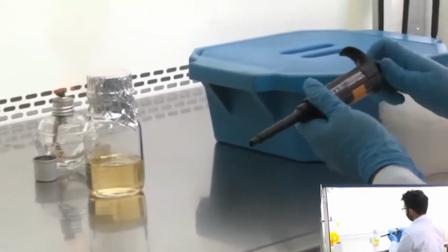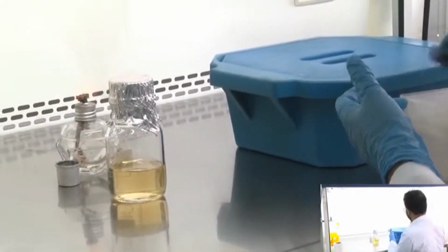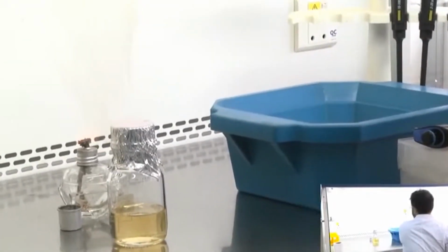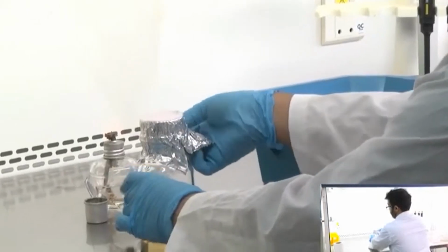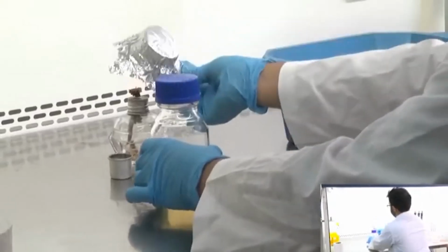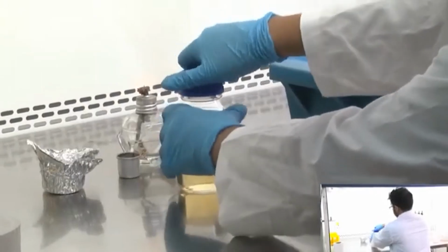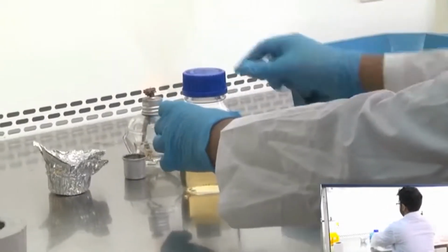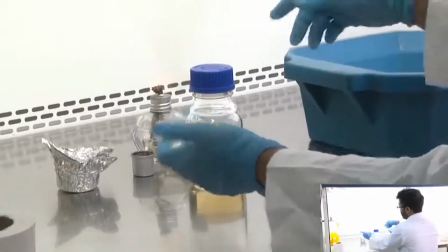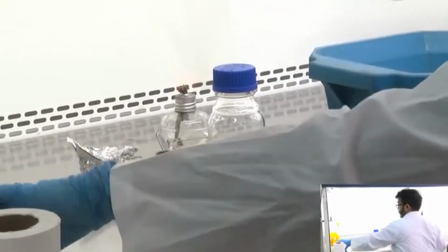Next, I am going to add 450 microliters of LB to those bacterial cells. This is autoclaved LB, so it is sterile. Make sure that your LB stock does not get contaminated. In case it gets contaminated overnight, you will see that it has turned cloudy and then you have to discard your media. So, yes, 5 minutes is over.